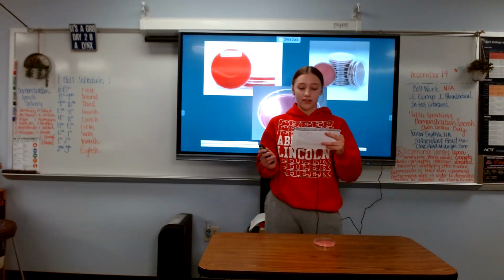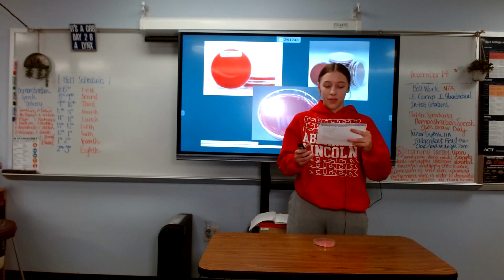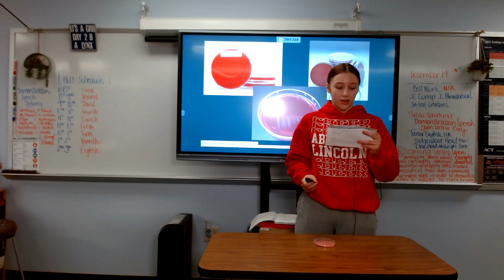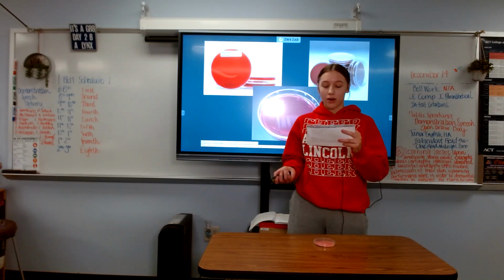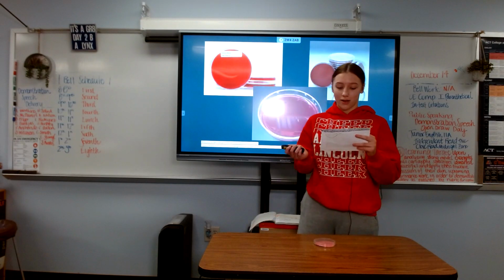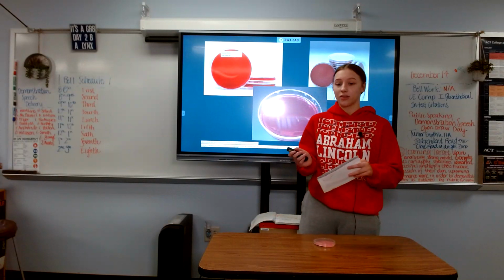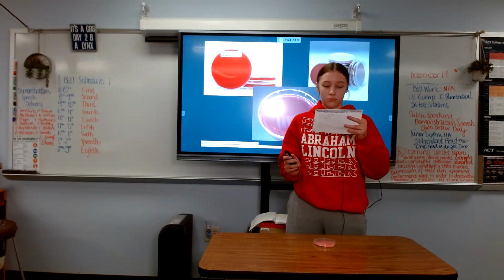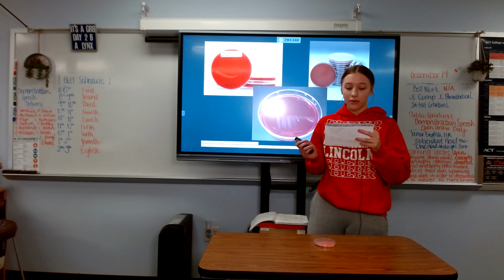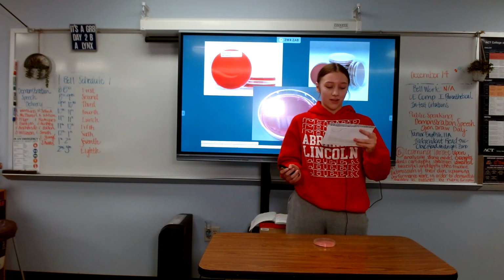There are varieties of agar plates. Essentially, an agar plate is where the bacteria can grow efficiently. Today, I will be talking to you guys about sheep blood agar, chocolate agar, and MacConkey agar. If there's any growth on the MacConkey agar, it will tell us that there's a gram negative species present. And if you are interested in microbiology, that is essential for you to understand.